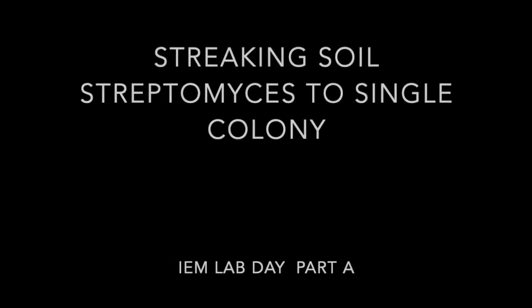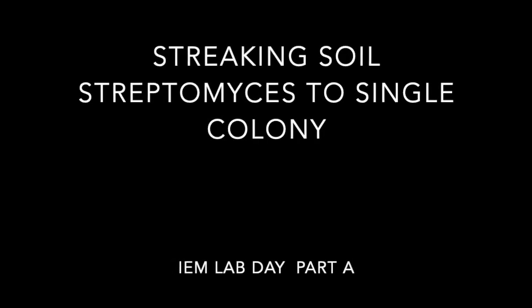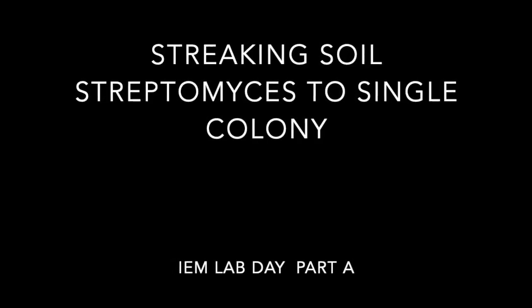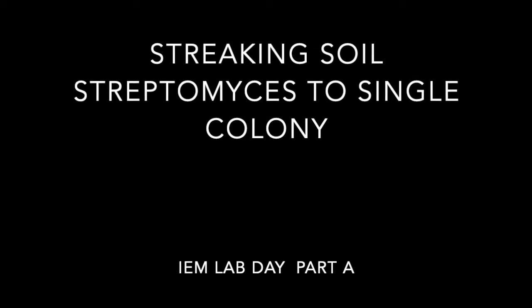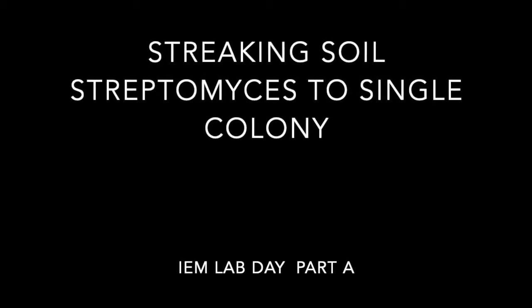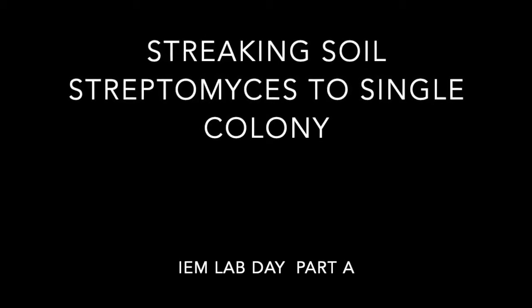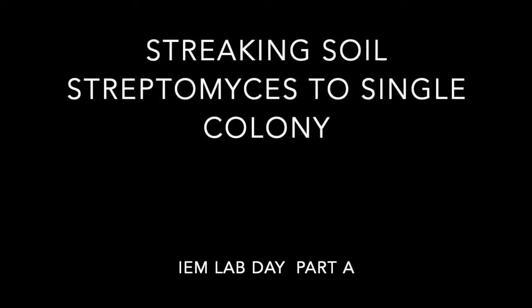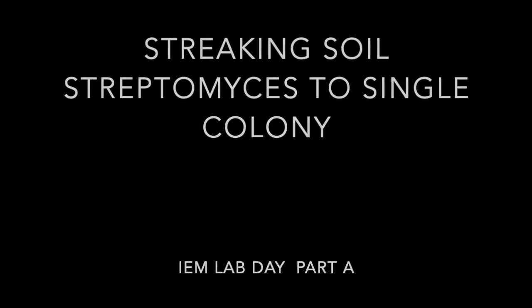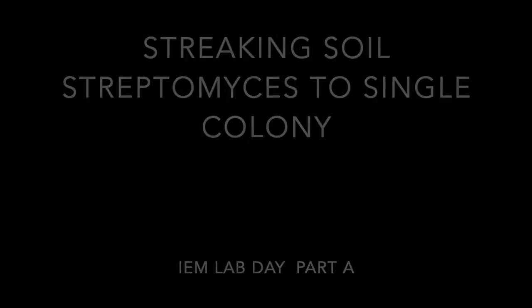In this video we will first look at the soil dilution plates that have now been incubated for six days. We will then pick some individual colonies and streak them to single colony on soya flour mannitol plates.